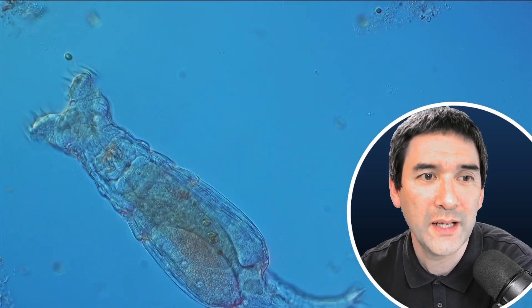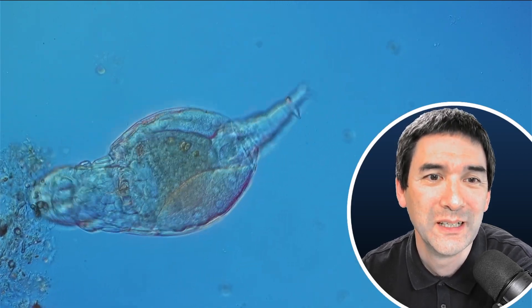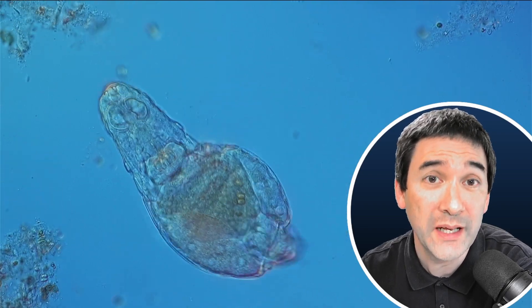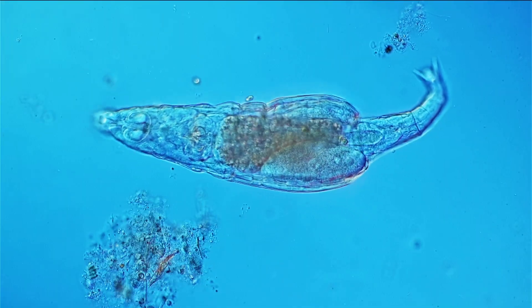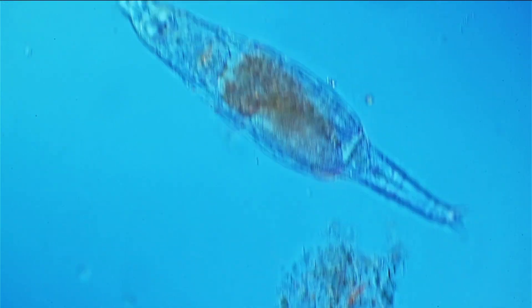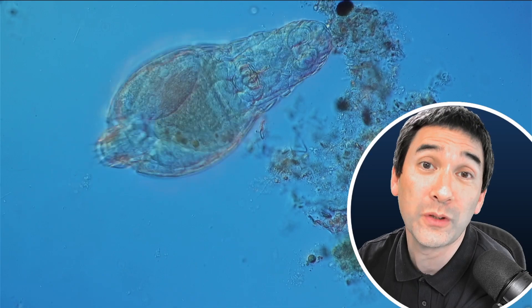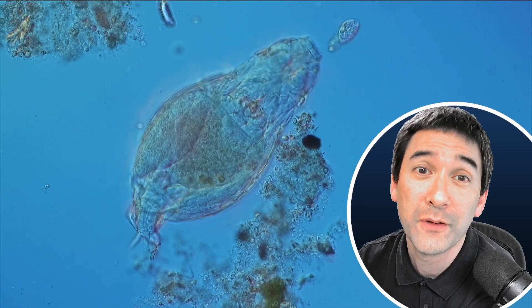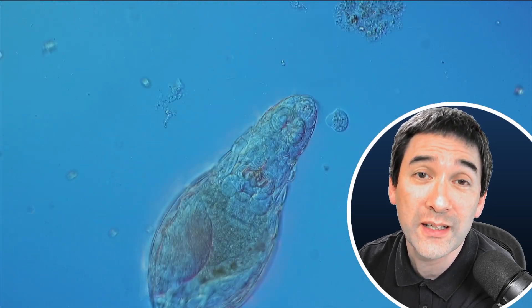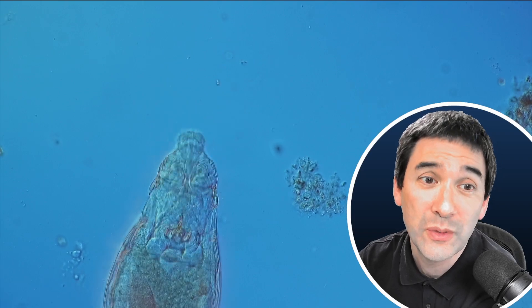At a slightly higher magnification — what a beautiful specimen! They lay eggs, and this is how they reproduce. The majority of rotifers is actually female — they've found an ability to reproduce from an unfertilized egg, which is a form of asexual reproduction. Scientists for many years were wondering how they generate genetic variability if the egg cells are not fertilized. They found out that rotifers have a remarkable ability to directly exchange DNA with each other to increase genetic variability.